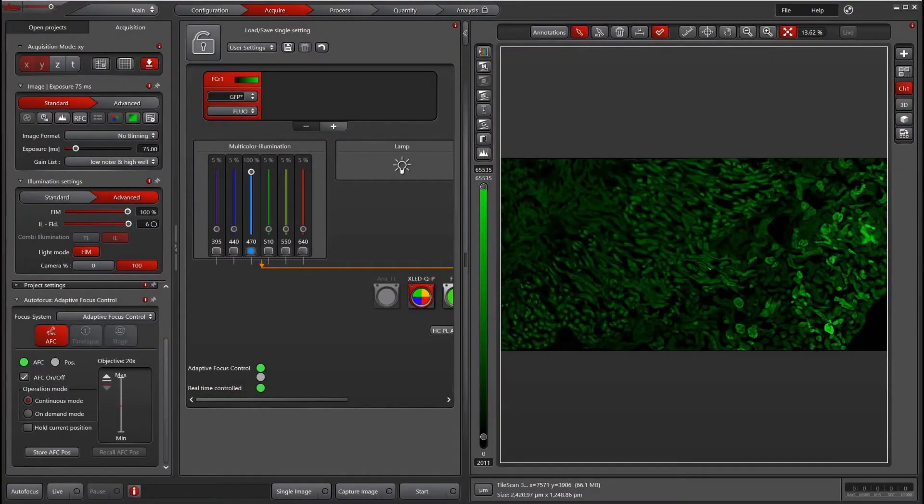In this video, I will go over how to use Adaptive Focus Control, or AFC, in your Navigator experiments.